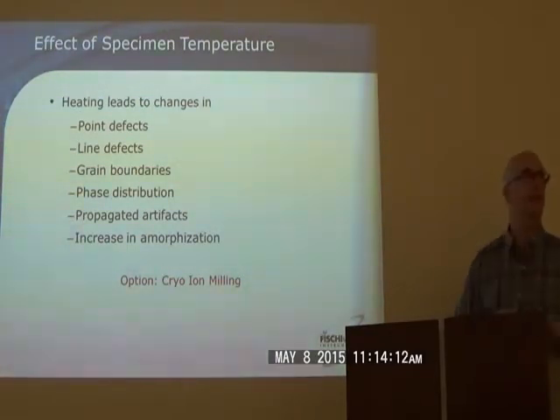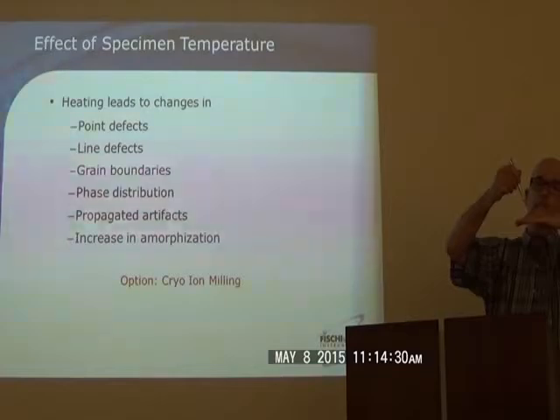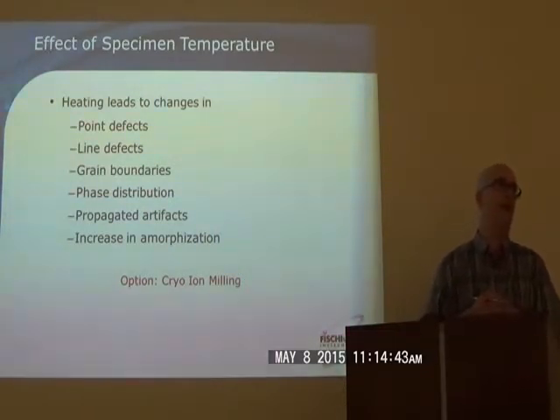And when the milling angle is too high, are you redepositing some of the material somewhere? Well, if it's too high, then you have greater penetration. I'll show that in a minute, but you can do simulation. So if you do have a higher angle, there's a volume where the bowl full of jelly is occurring, and as you go to a higher angle, greater penetration and more probability for amorphization or preferential milling.